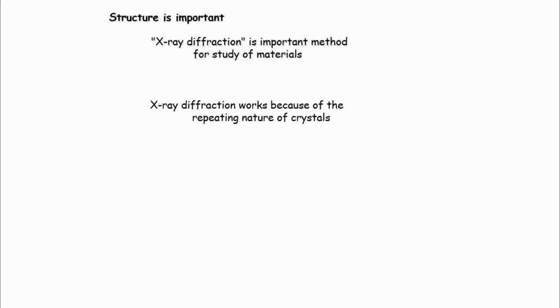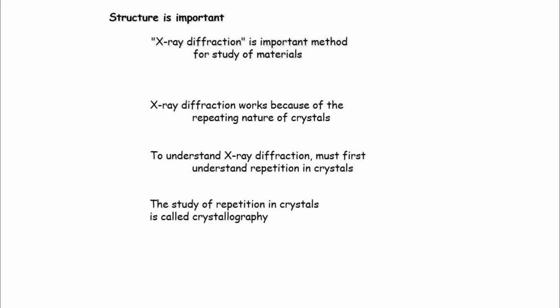So when I'm talking of one unit as your classroom, you have multiple classrooms, so it's basically a repeat of this unit cell where you are sitting right now, right? And these repetitions will also give diffractions in the X-ray, right? And these repetitions will also give information based on the unit cell. Now if you understand this unit cell, we can also understand why my data is getting repeated, why my X-ray is getting diffracted in the similar pattern in all other unit cells, and that will give us the final information which will be more like a repetition in crystals, and this entire thing is called crystallography.